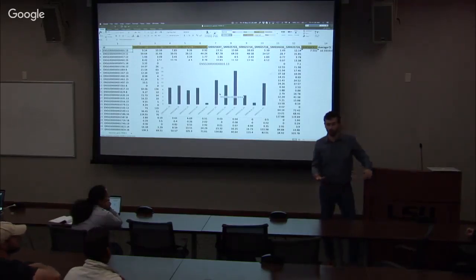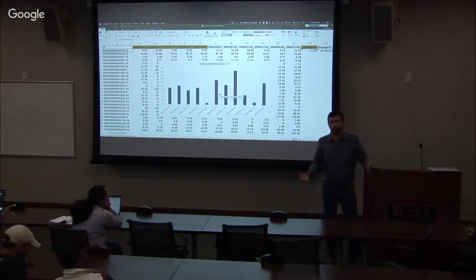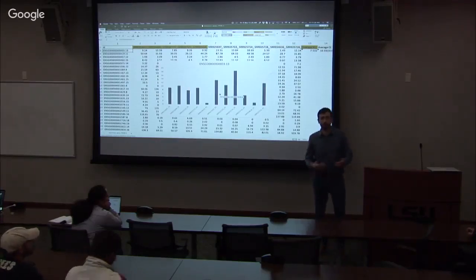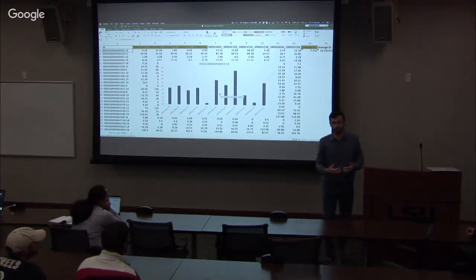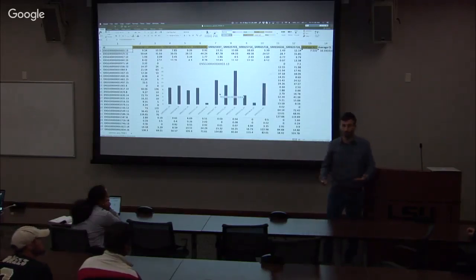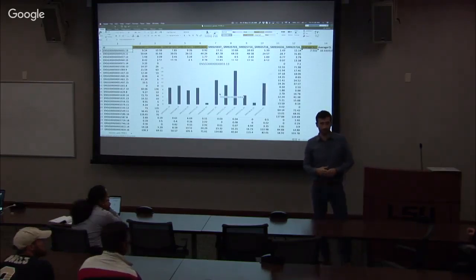What you would want to do really is do summary statistics and look at your moments, look at your skewness, your distribution, etc., and then do normalization based on those. For example, under utilities, you have something that's called quantile normalization, right? Yeah, like with arrays. Exactly.